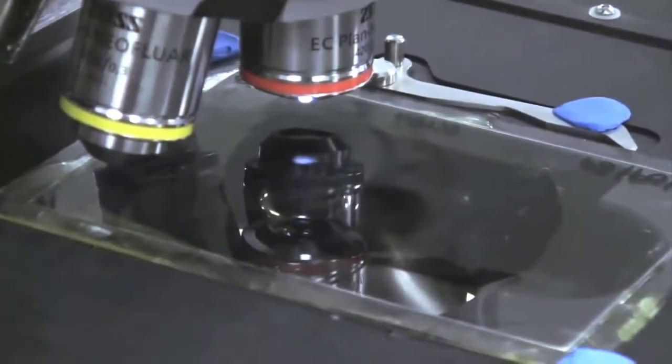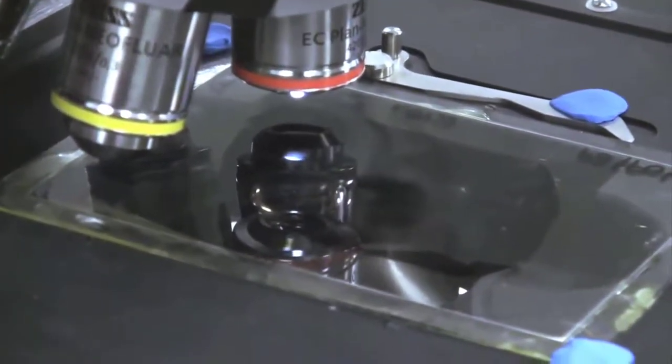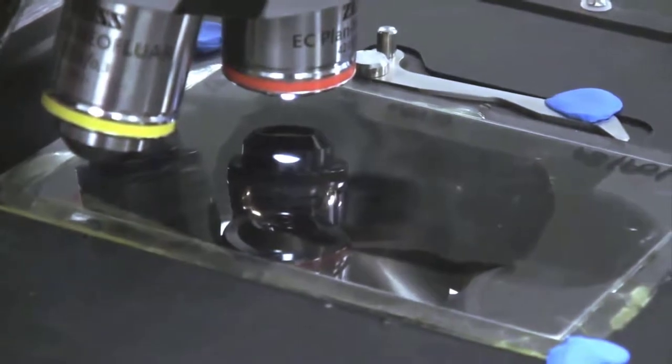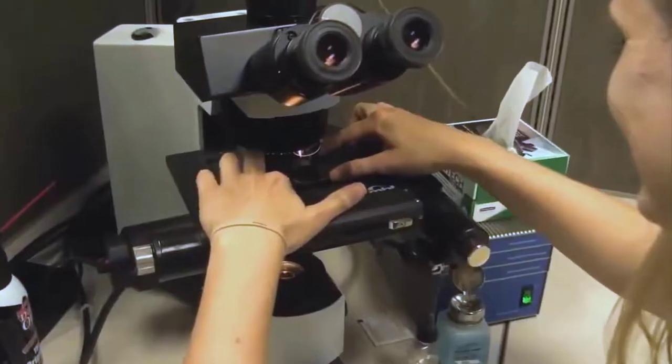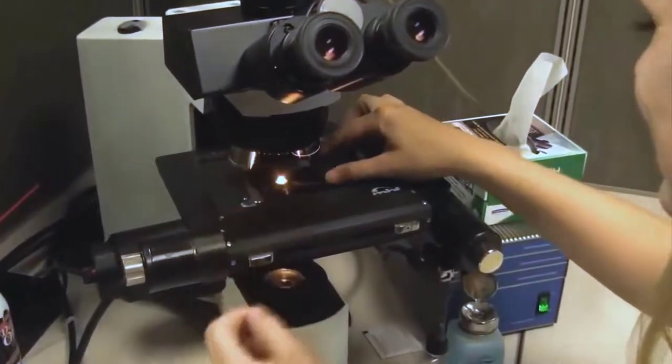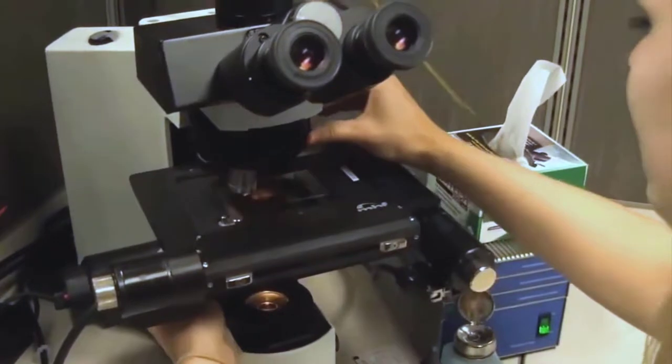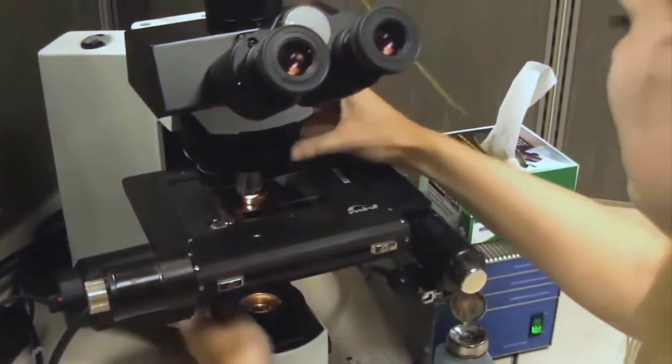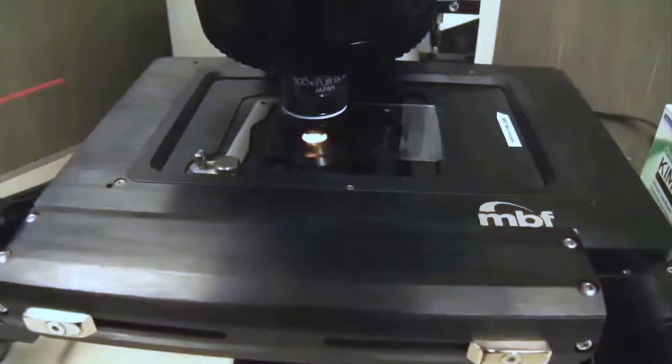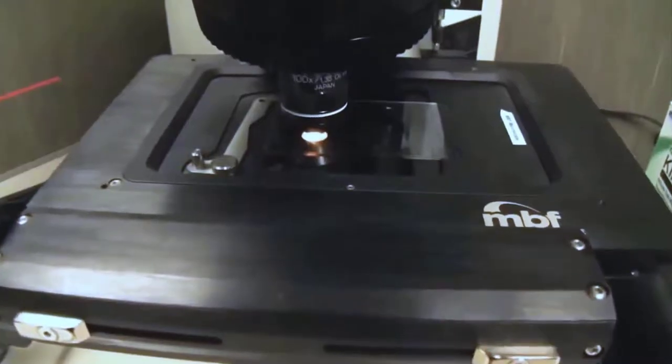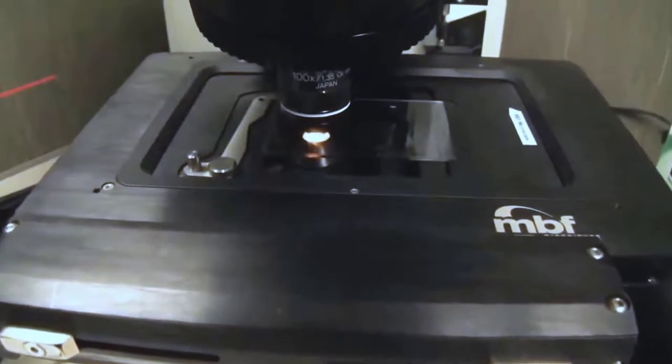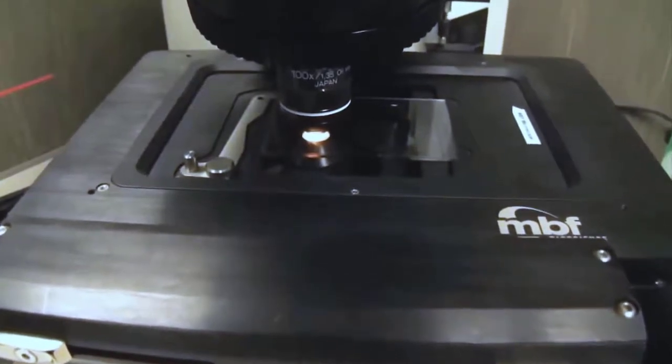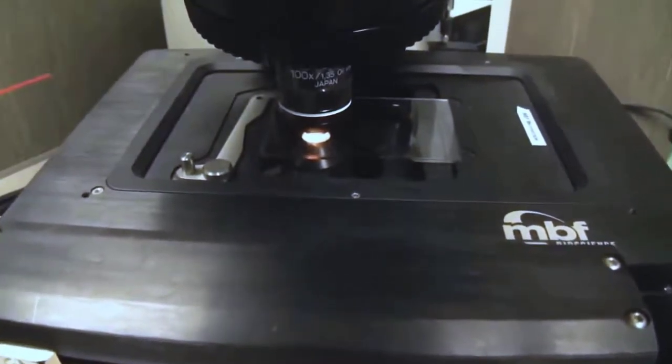Stereo Investigator seamlessly integrates with all the major microscope vendors. Stereo Investigator is also capable of fully controlling motorized XY stages, motorized focus systems, motorized focus wheels, shutters, LED illumination devices, and a wide variety of digital cameras at their full resolution.